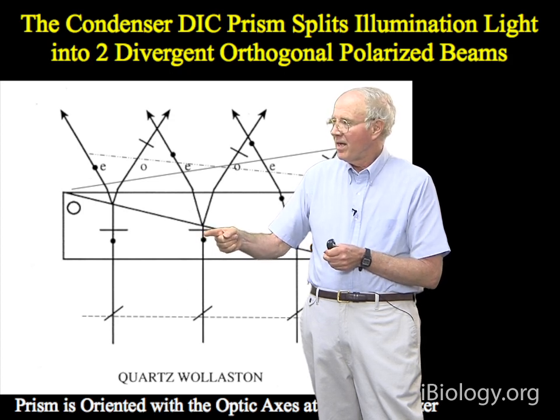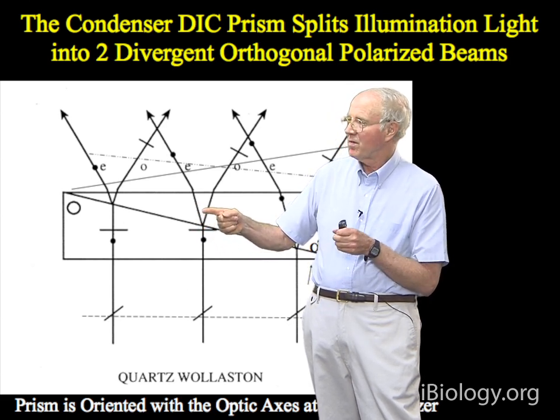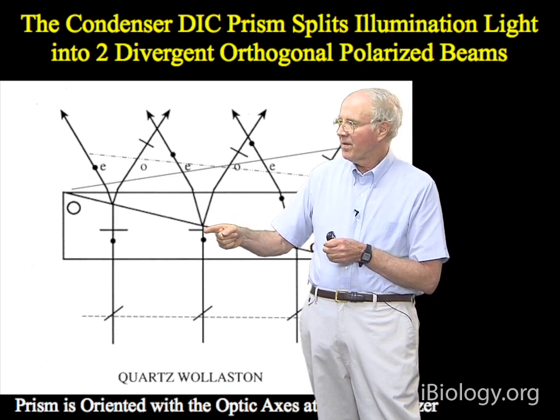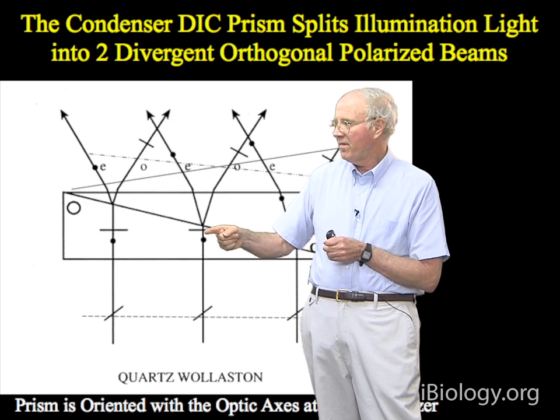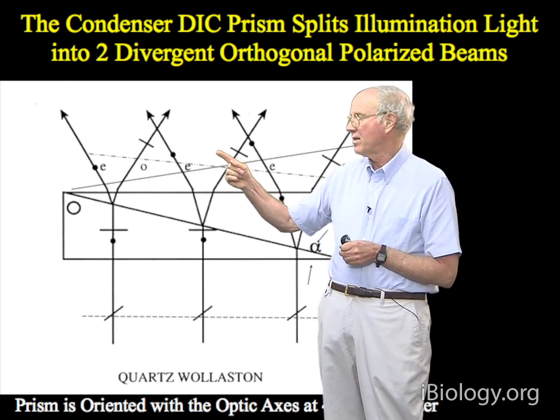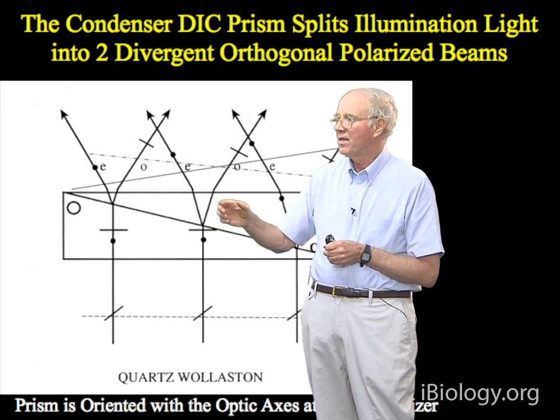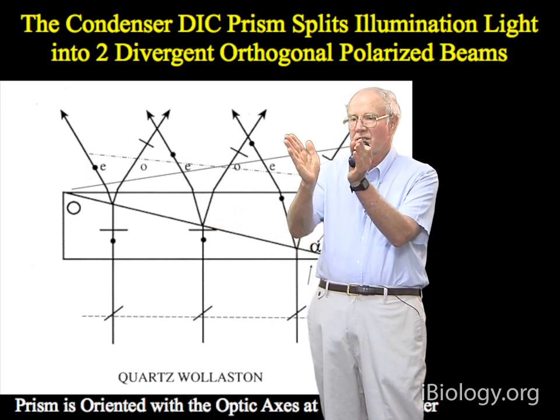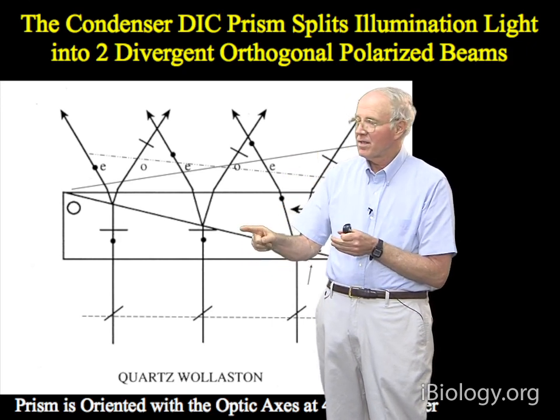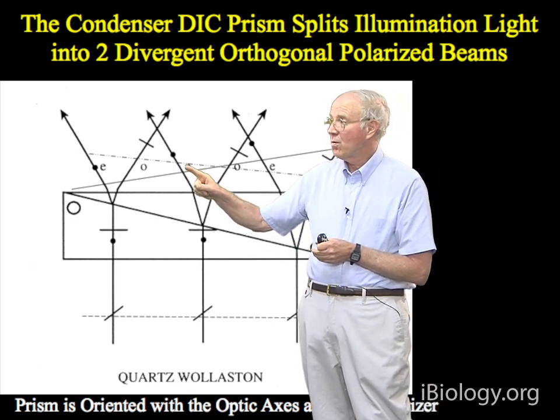And then we hit the wedge boundary, in which the axis directions of the crystal are reversed. This causes refraction at the boundary, so that one wave is bent away and moves off to the right. That's this one here. And the other wave is bent the other way and moves off to the left. And so the two wavefronts then diverge from each other based on the angle of this wedge and on the differences in the refractive index, right? So what we have coming from the wedge are these two wavefronts.